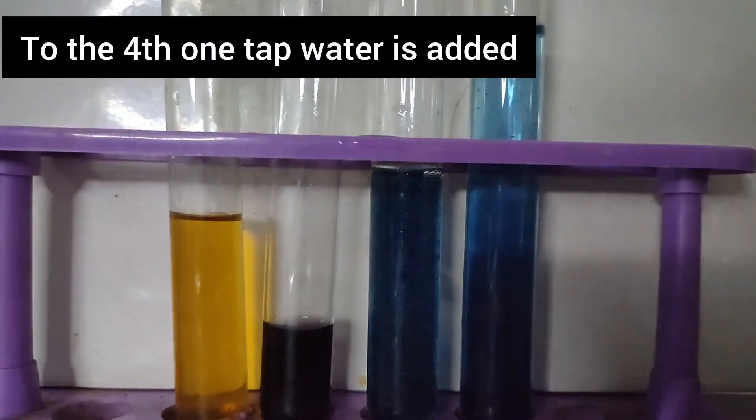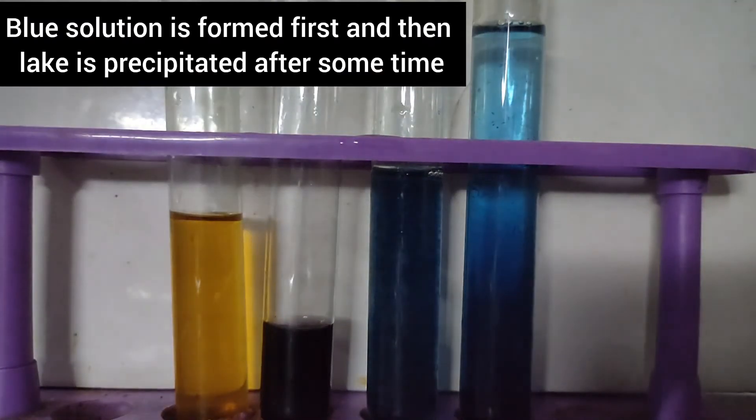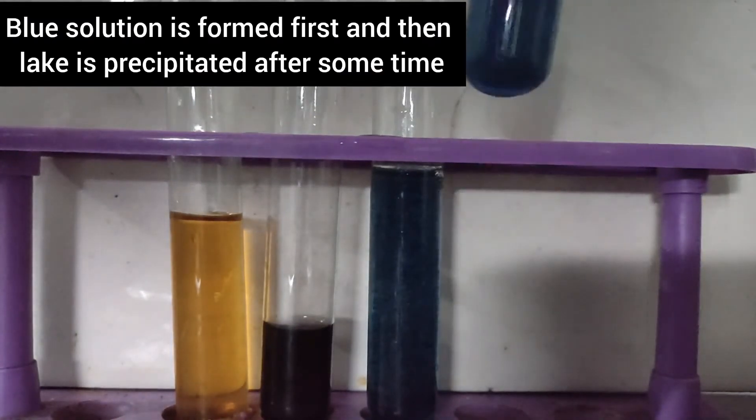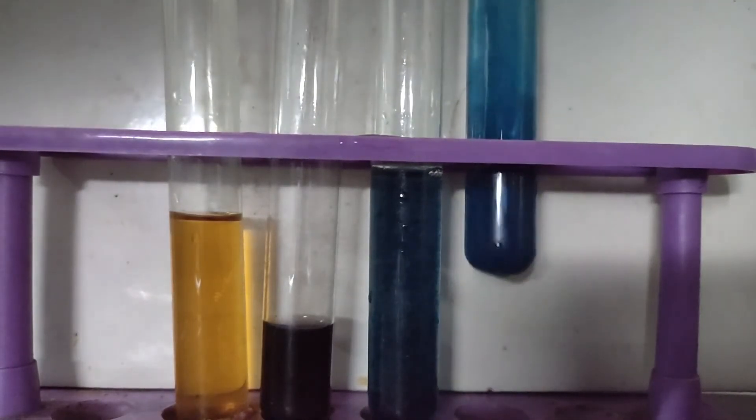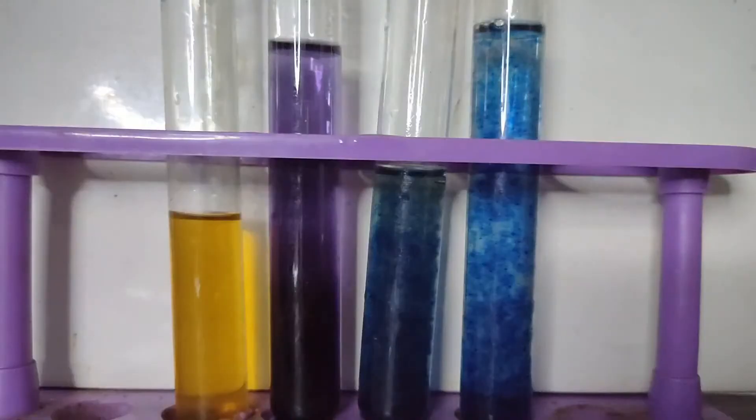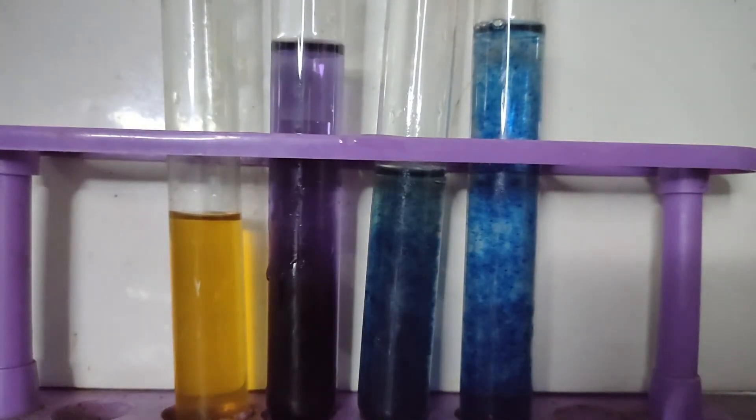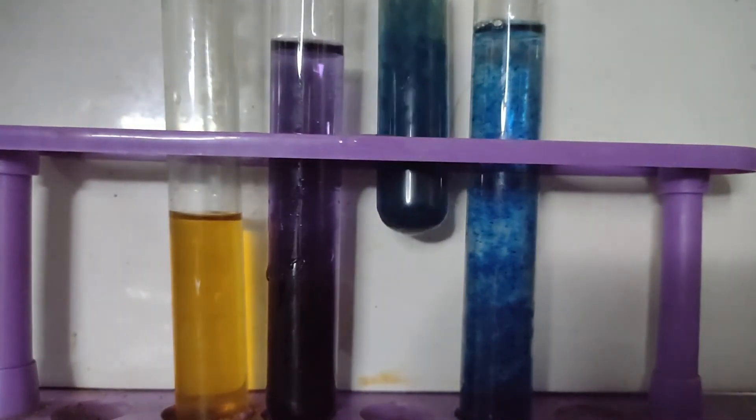In the fourth test tube, some tap water was added and a blue colored solution is formed on the top. After some time, the lake precipitates. In the second test tube, some more distilled water was added to show the colors.